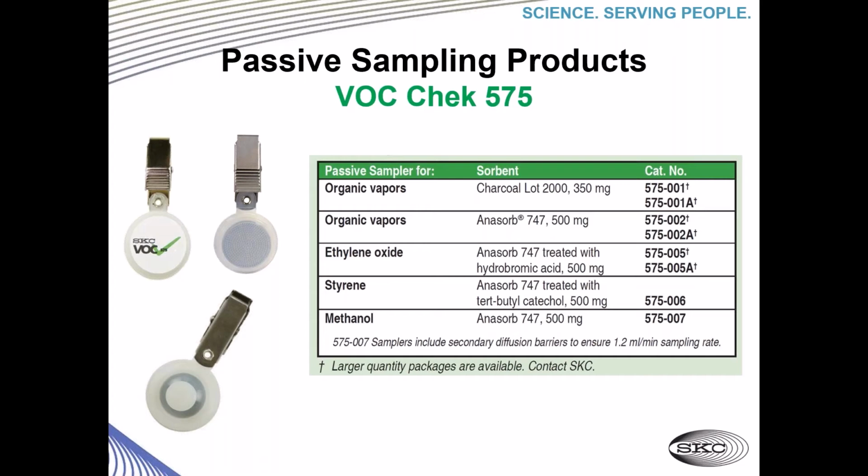But since the sorbent is more expensive than activated charcoal, we also offer a 575-001 with charcoal for organic vapors, as specified in SKC's internal validation studies, where it is appropriate as a cost-saving option. So that's the reason that you see the two different organic vapor samplers.